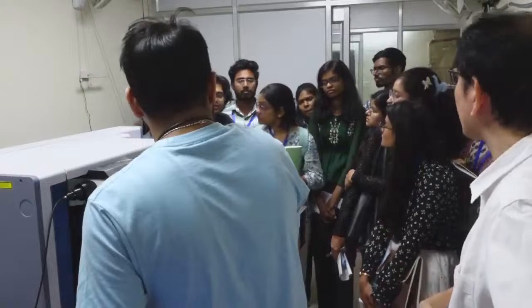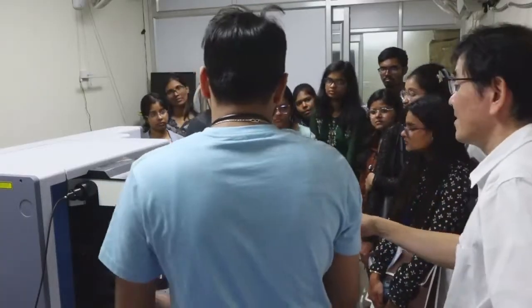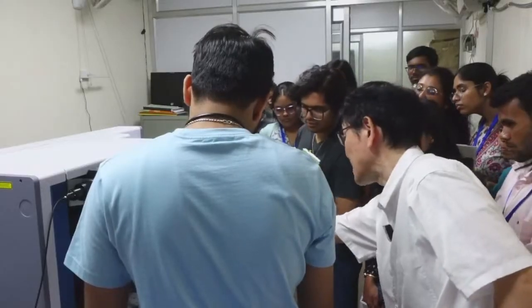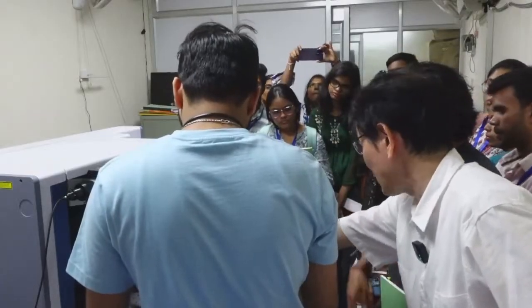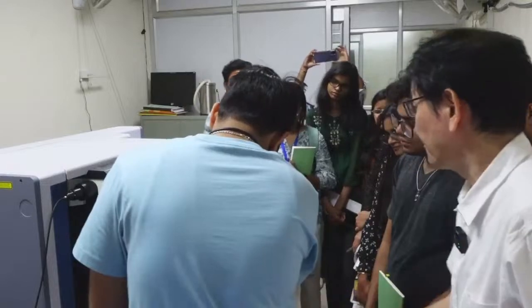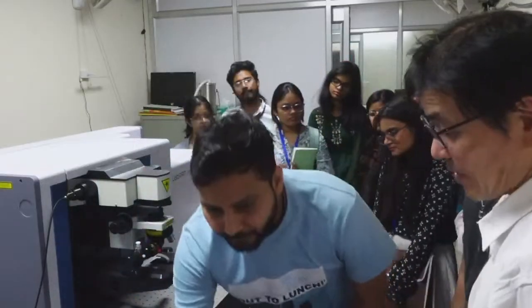Can you explain again what that thing is? This is an attachment. Light typically passes through the microscope objective and focuses on a small spot. But this is not a microscope objective. Light is transferred to the left to irradiate the sample. There is a mirror. And this is a typical Raman measurement.